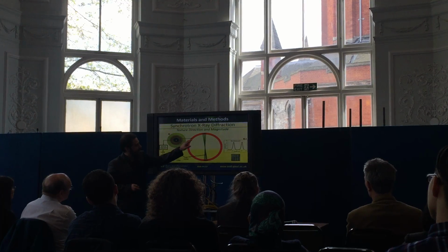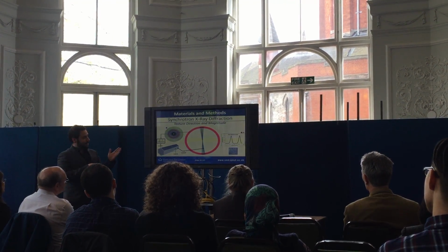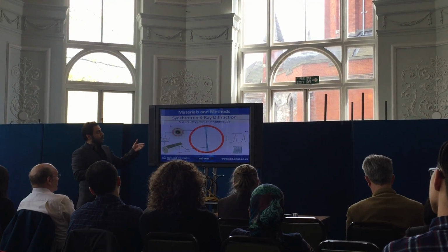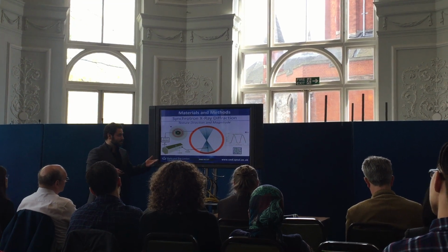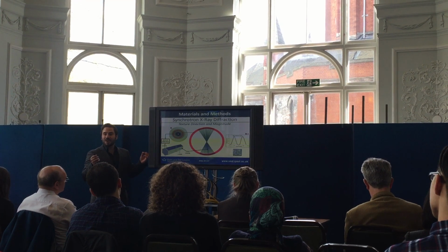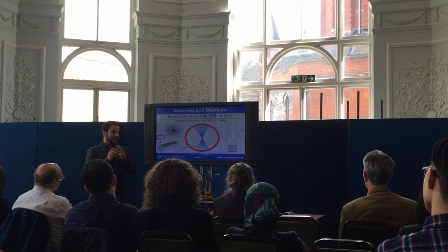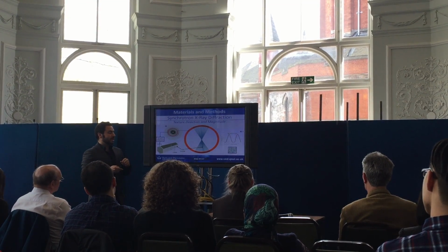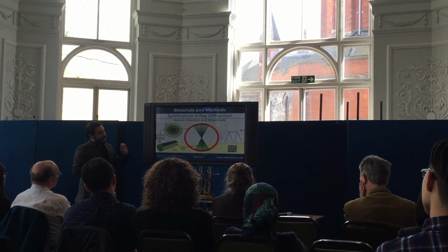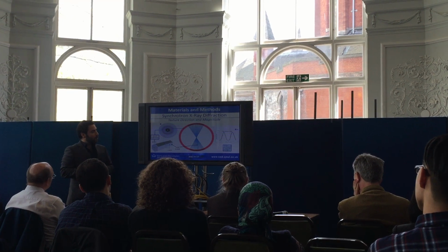Now you can see the arc starting to form. This is a well-aligned probe region. Now, if it's less aligned, as you can see here, we will have thicker arcs because it's divergent. The crystal is divergent, as I explained when I explained what texture was. If you see here, when it's less aligned, the peaks are wider.